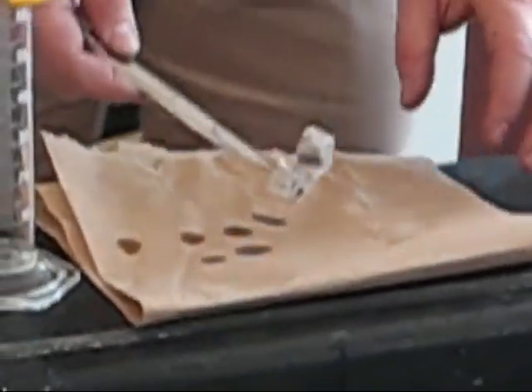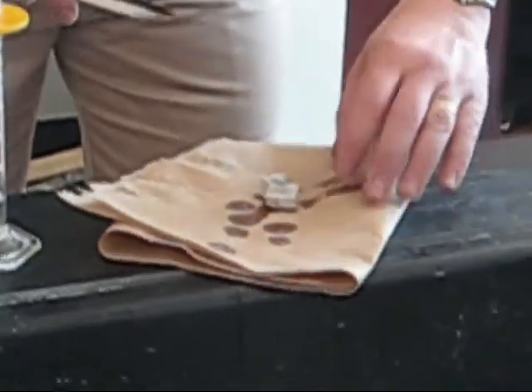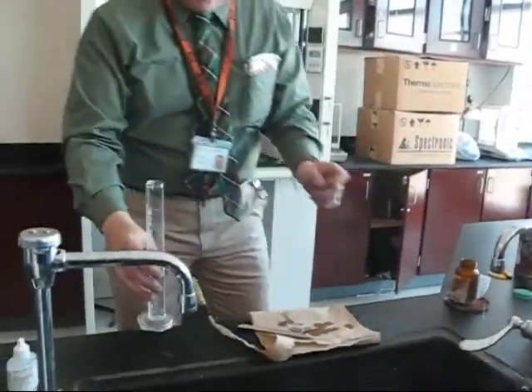Here we have our old friend sodium. Here's a chunk of sodium. What I'm going to do this time is put a little bit of water in a graduated cylinder. You know it reacts violently with water. Do you remember that? Yeah. You might as well stop asking about the whole chunk right now. It ain't going to happen.